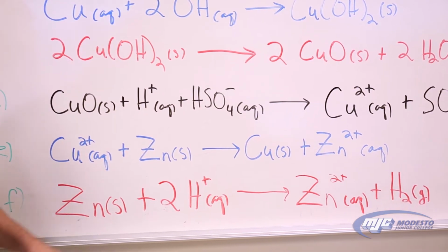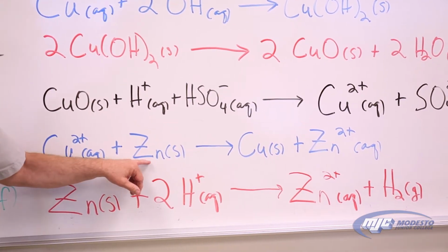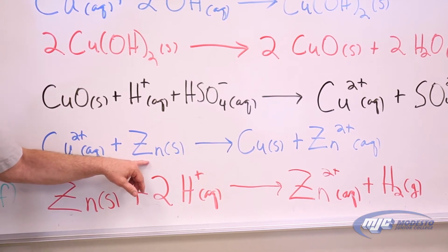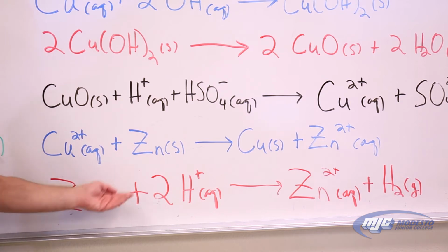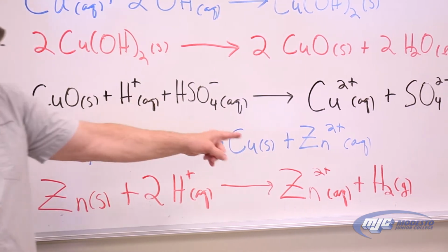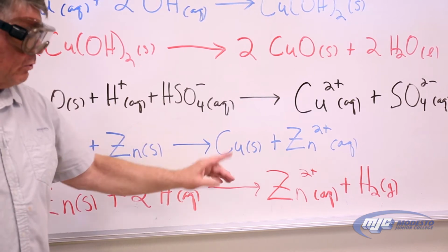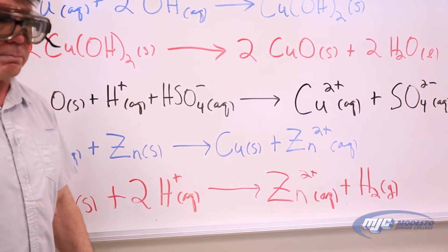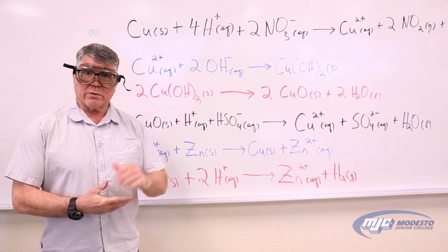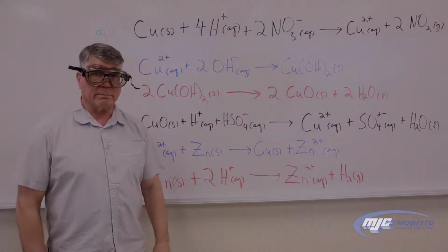The last thing we're going to do is deal with the zinc metal that's probably left over, because we add some excess zinc in this reaction. So we're going to take some hydrochloric acid and just dissolve that zinc metal, and we're going to get hydrogen gas off at the end. We have to do this in the hood too, because hydrogen gas is flammable. That's what we're doing, so why don't we go over and get started on that reaction.